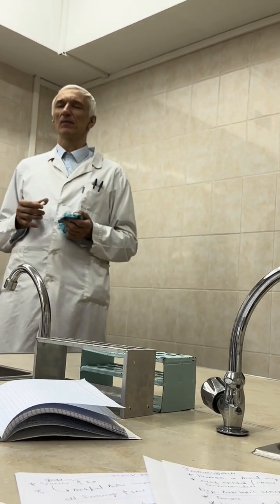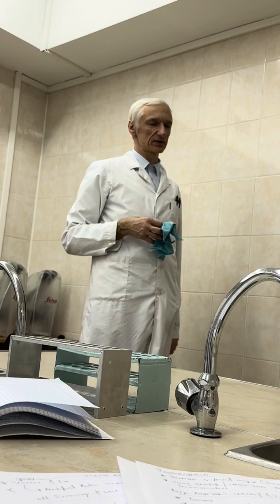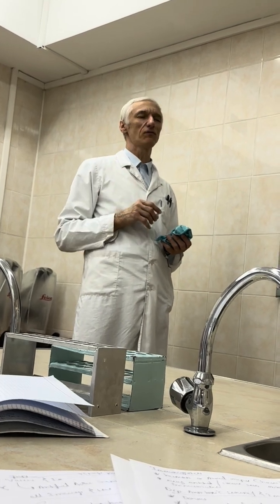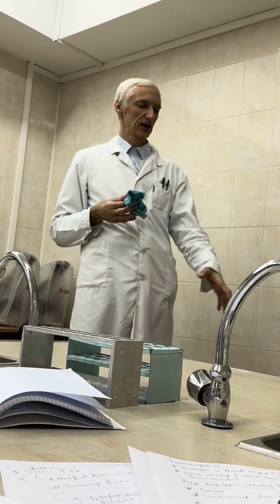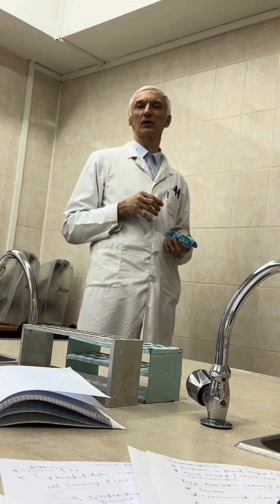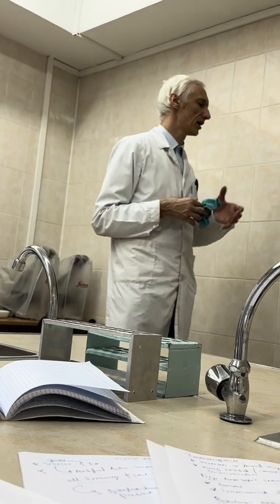That's why we use, I will not draw now, the movement of rays in the optical system of a bright field microscope. So simply, the use of immersion oil makes a uniform optical medium when information goes from the slide to our eyepieces and eyes, because the refractive index of immersion oil is the same as in glass, and the optical system becomes homogeneous all the way. Is it clear? Okay, so that's why I revise this one.